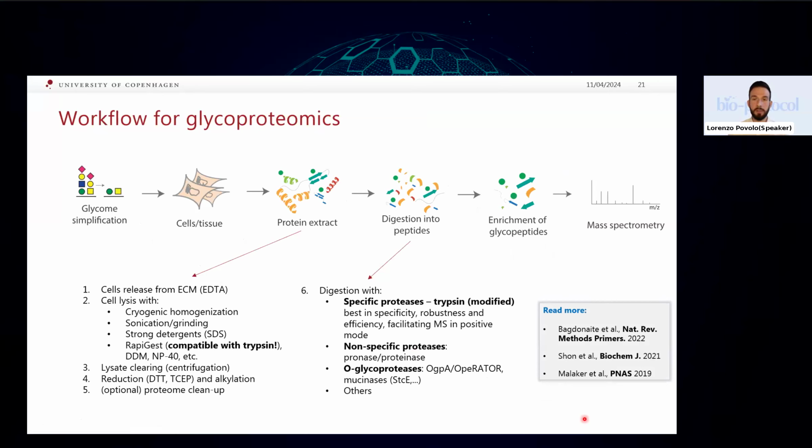This involved the use of digitonin for permeabilization of the cells and release of soluble cytoplasmic proteins that, in my case, I was not really interested in. In that way, I could solubilize the proteins in the secretory pathway, in the organelles, and importantly in the membranes, using a mild detergent, for example NP-40, while keeping the nuclei intact.